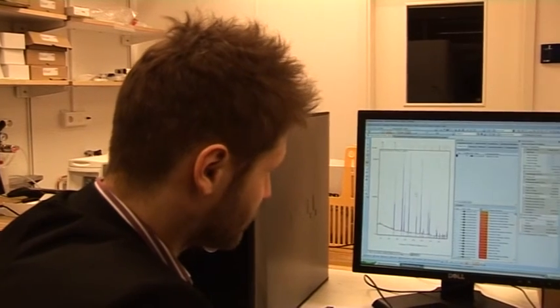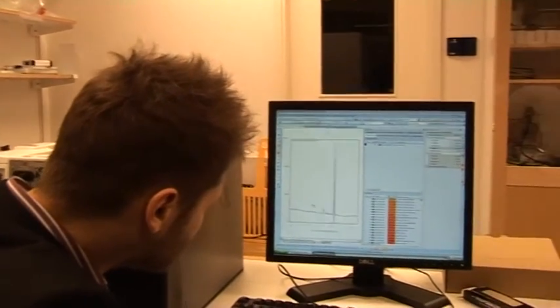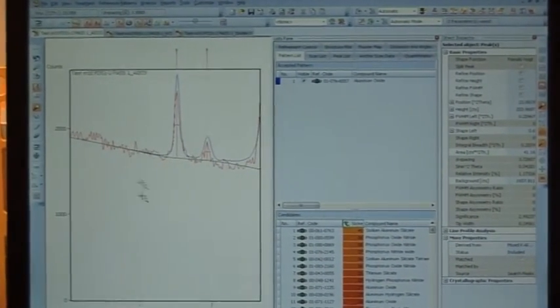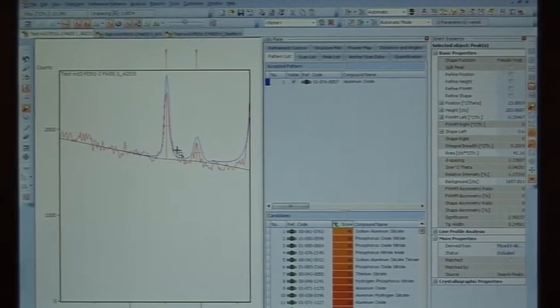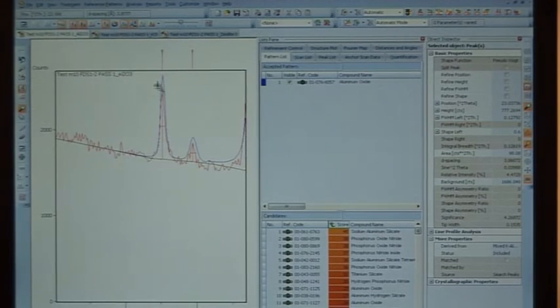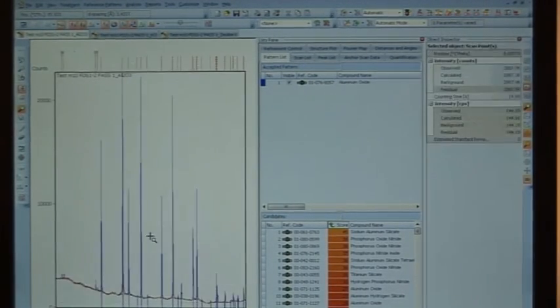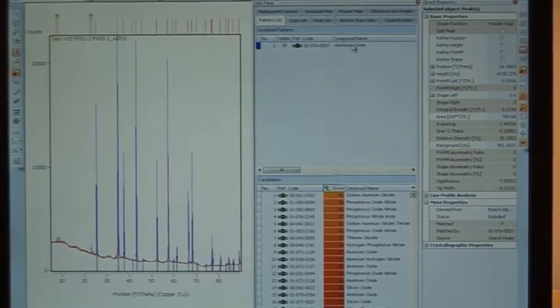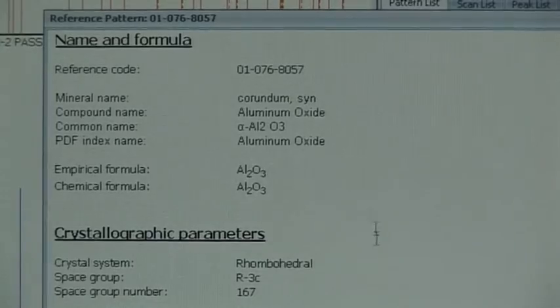Okay, so we've done now. The machine or the software has completed the evaluation of the diffractogram. If you look closer, like here, this line is the background that is determined. And then you can either agree or disagree. Manually you can make it differently, that it maybe fits a bit better. This is quite approximate, this automatic treatment. Then the blue line, it tried to mathematically describe the peak. And then the last step, it also stripped this K-beta radiation and everything. And then it tried to compare. And we actually got a nice result. So the machine thinks that this is aluminum oxide. And that's what we had. It's even alpha aluminum oxide, which we should have. So it's very good.